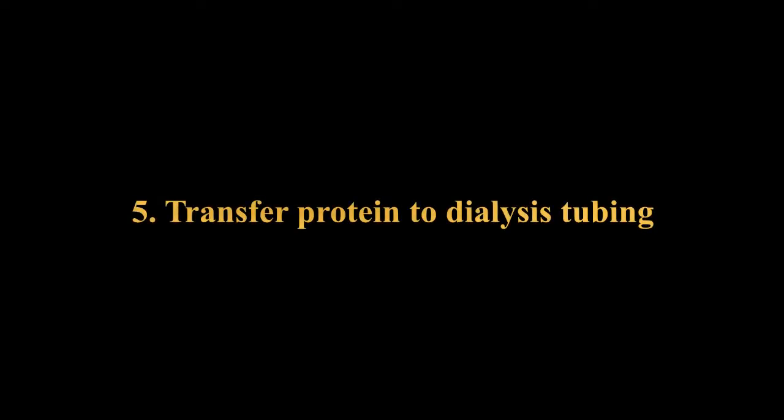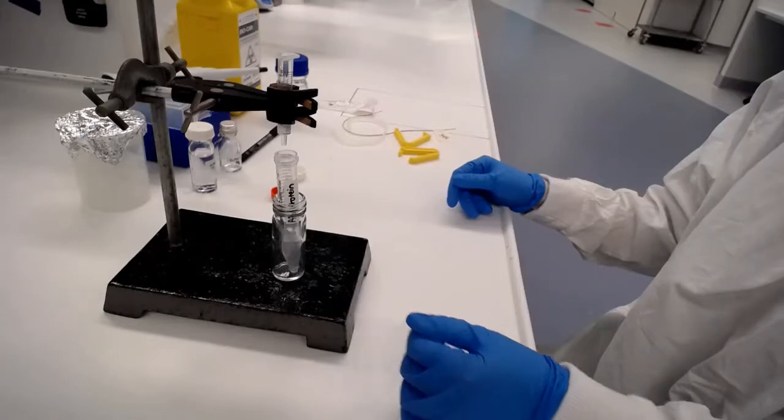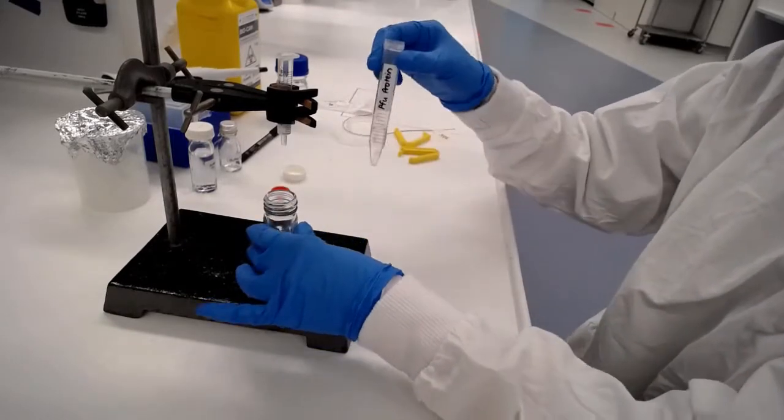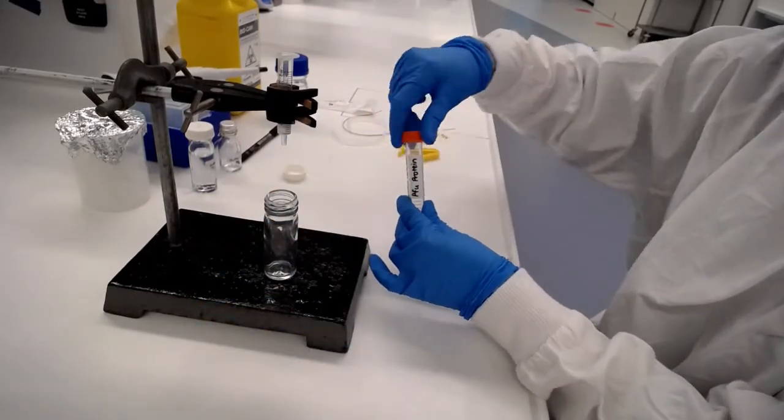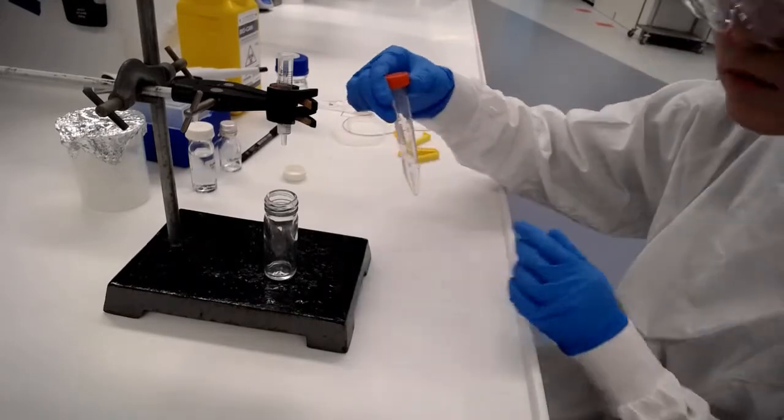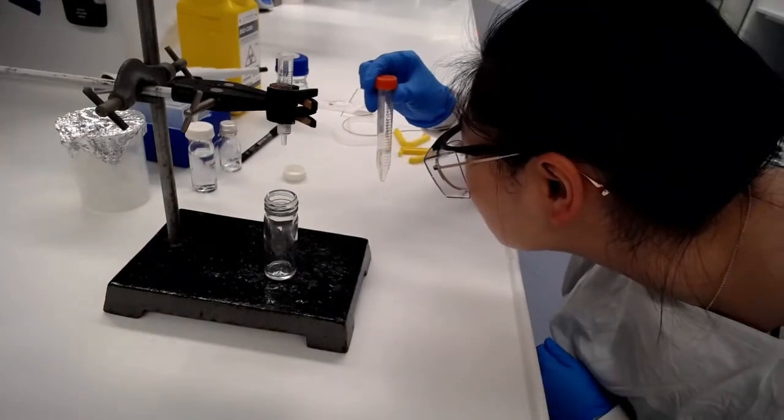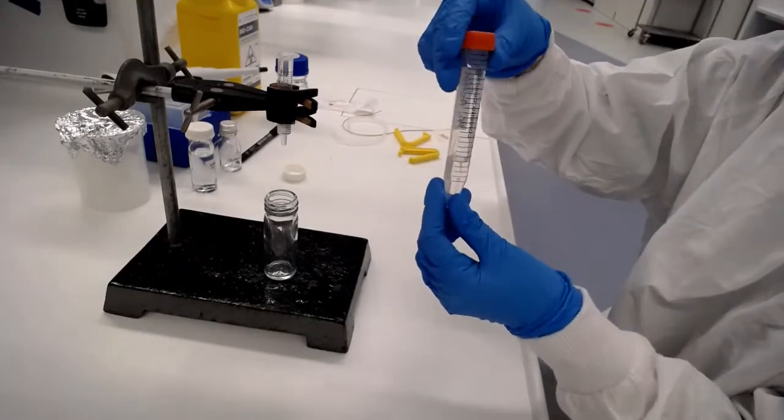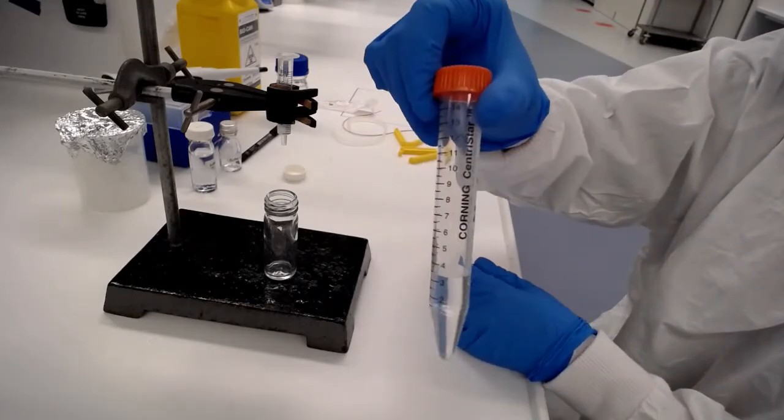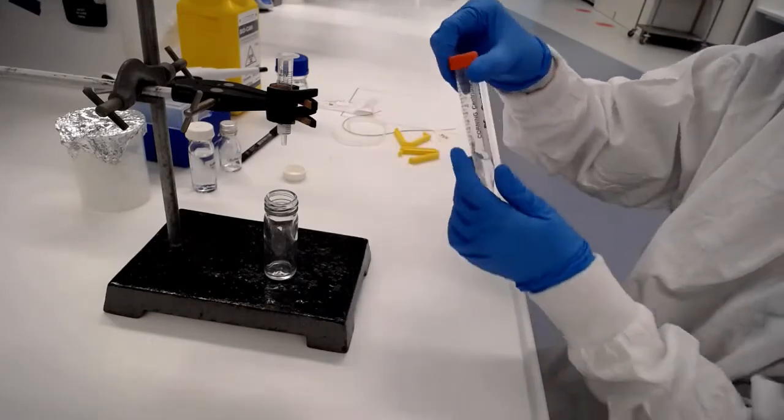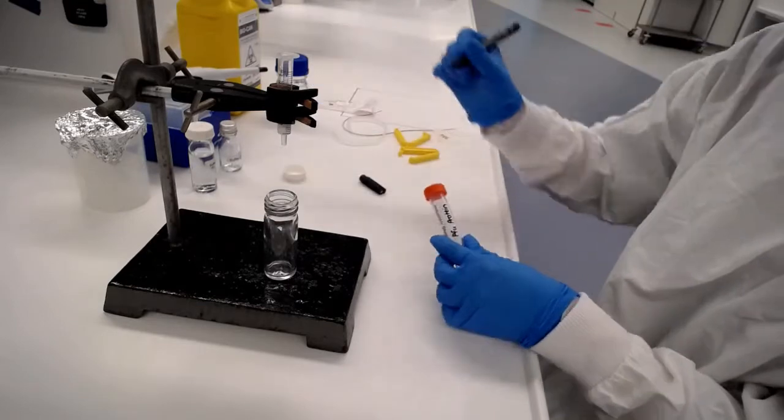We add three mils of buffer C and collect what's left. Now what's come out the bottom of the column should be our his-tag PFU protein and we just have to check how much we've got because this will help us later with our yield calculations. We've collected about three and a half mils there.